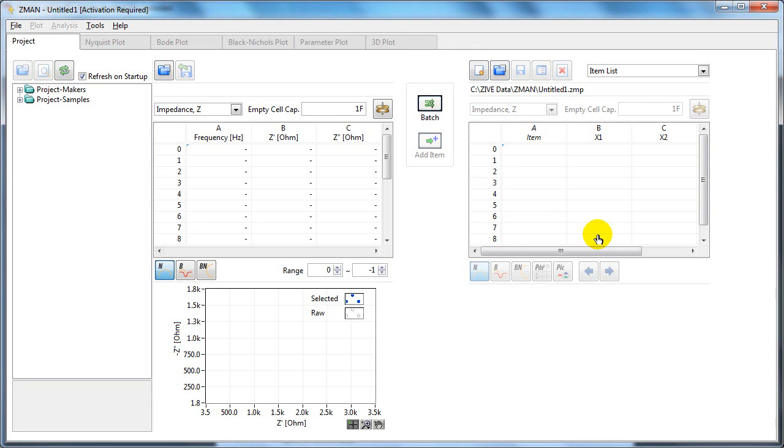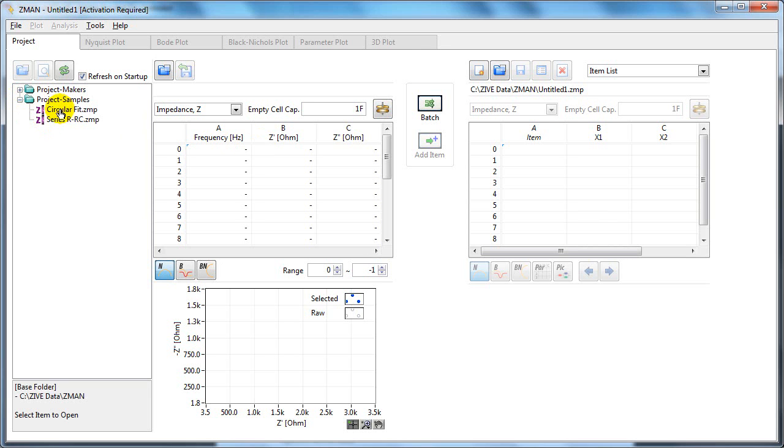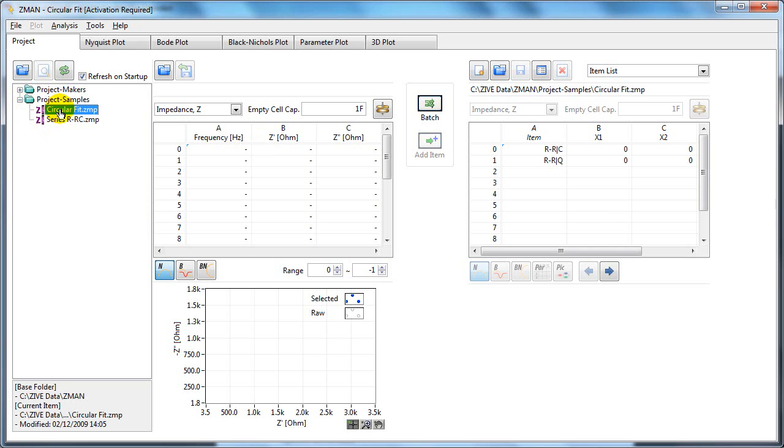If you've already been working on a project, you can open it from the data file section. So you can open the folder, and if for example you double click here, it gets opened in the analysis section.